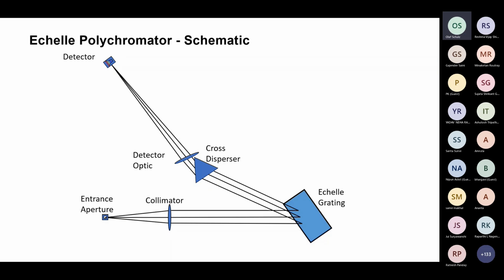The diffraction produces multiple overlapping orders. And since this overlap is not really useful for measurement, a second dispersive element, a grating or a prism mounted perpendicular to the dispersion plane, a cross disperser or order separator, is placed into the light path. Now, the resulting spectrum consists of a stack of stripes with different but slightly overlapping wavelength ranges imaged onto a plane surface. The typical trapezoid shape is caused by the fact that the different orders are shifted against each other, and the image is limited really by the size of the cross disperser.